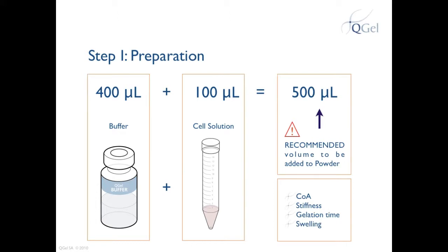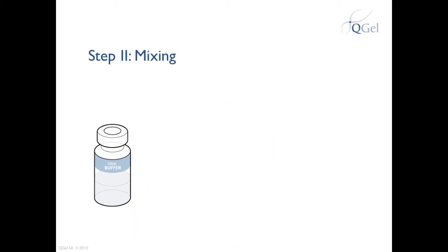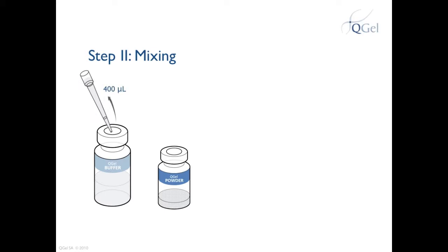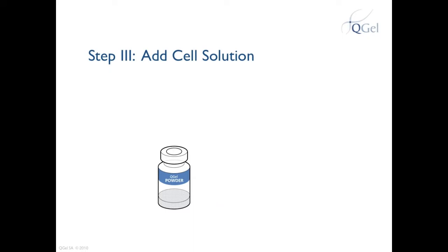Now that your buffer and cell solution are ready, let's see how to add them to the powder. Take your buffer and prepare the vial of QGEL powder. Pipet 400 microliters from the buffer and add to the powder. Mix well, preferably with a vortex, for about 10 seconds. Now take your cell solution and pipet 100 microliters.